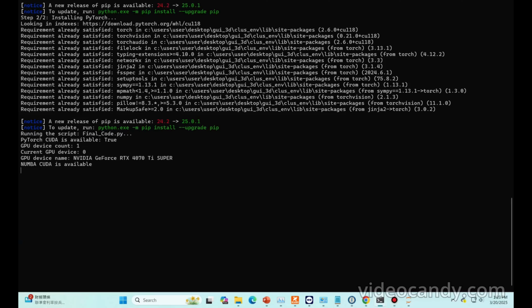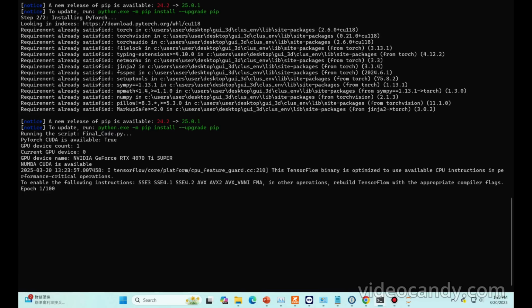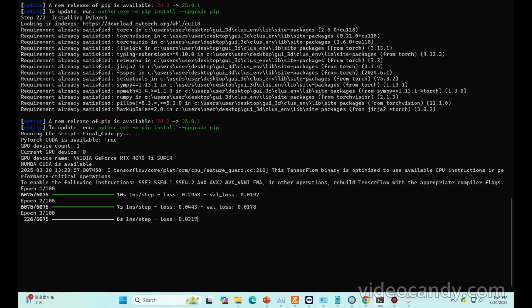And again you see it's running on GPU because I already configured GPU on my system, but you have to check your system as per the user how it works. Again you have to wait, and you will see the processing later.